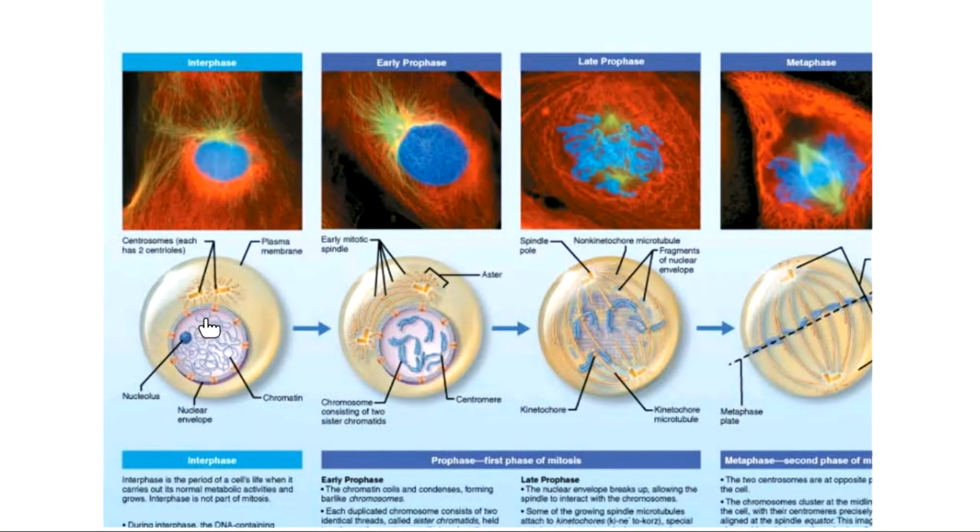So remember, chromatin is that spaghetti noodle mess that we have of the genetic information floating around inside the nucleus. So if you see, let's go back up to our image. Our cells, unfortunately, are not nearly as beautiful as these. Ours aren't colored, but the genetic information in these pictures is blue. Notice how we just kind of see a fuzzy blue appearance here.